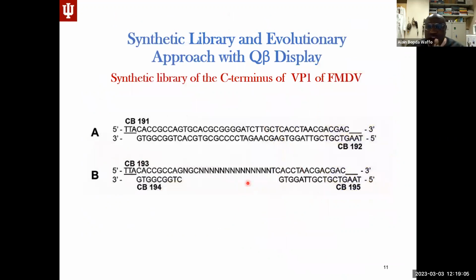So this is just one application. Back in the day, foot and mouth disease was really disturbing. It was something in livestock disturbing a lot. And my approach was to see if we can use phage to inhibit this virus. So the first thing was to know the major epitope of this virus.